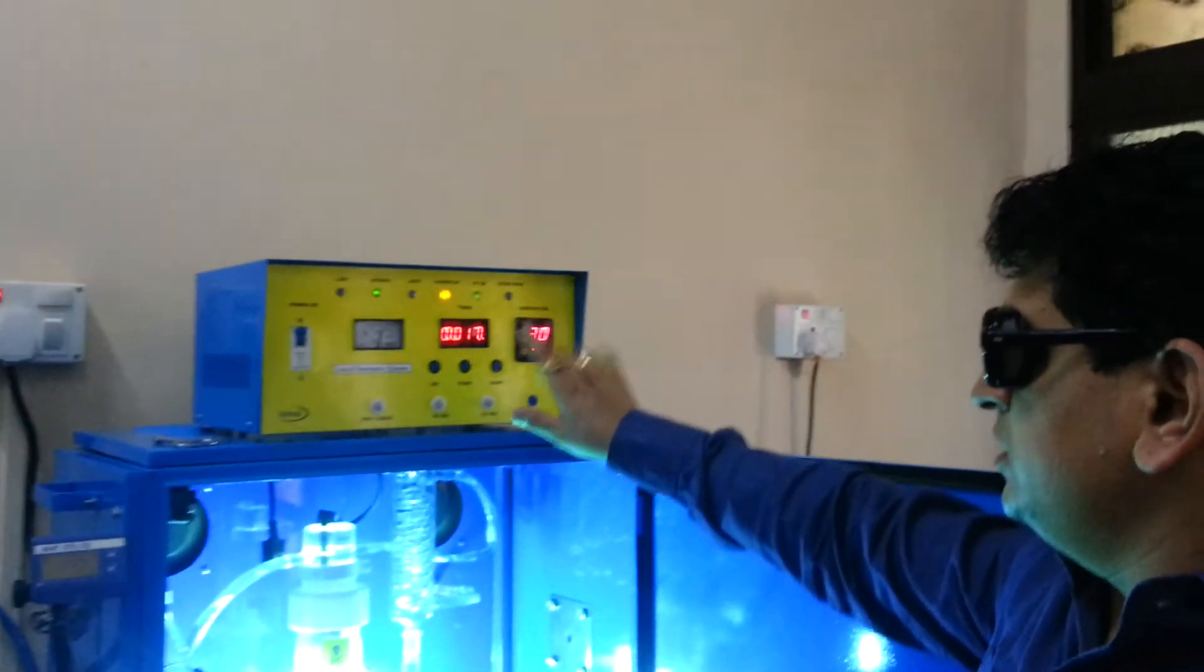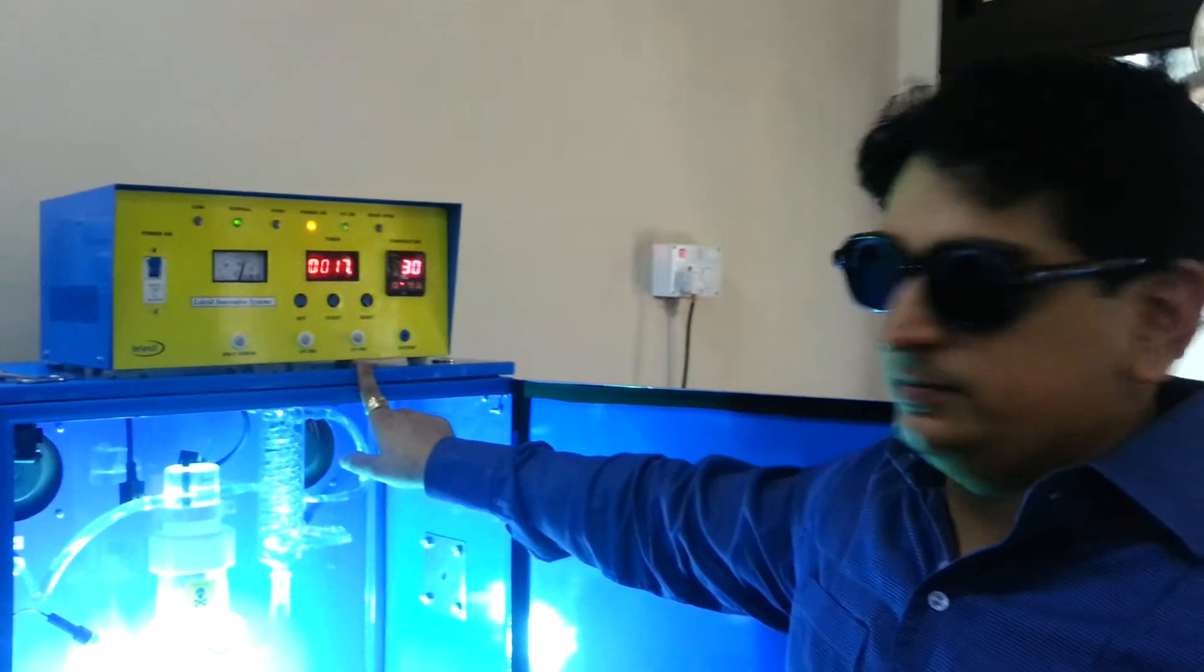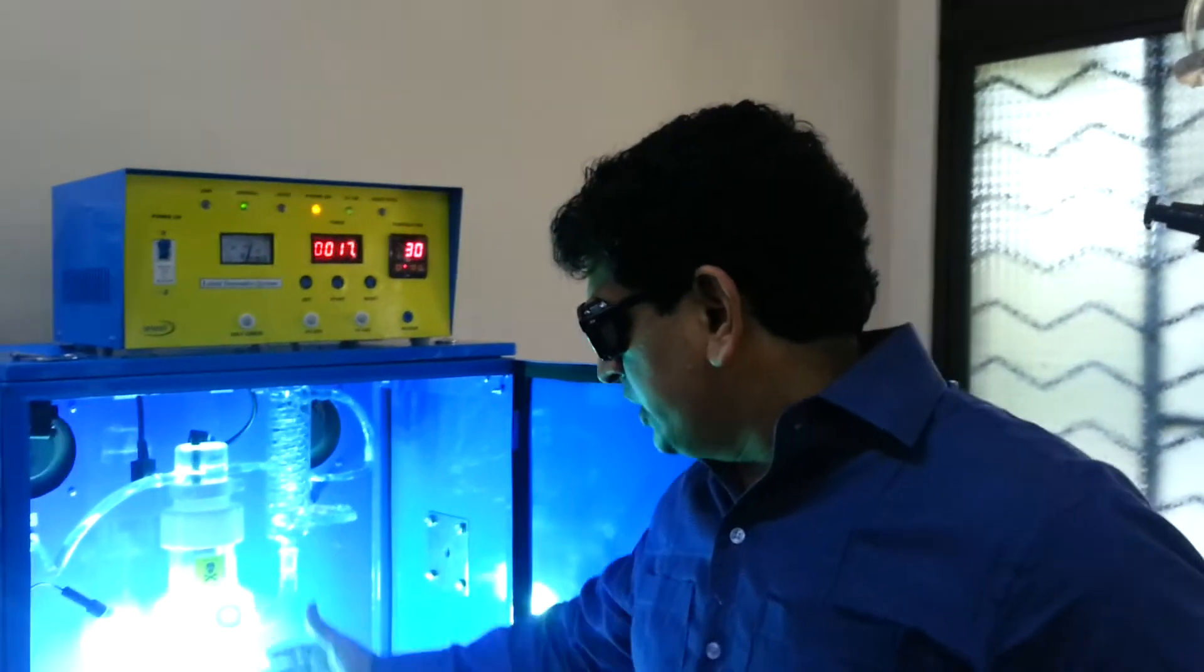This is a controller having dual option for 250 and 450 watt. Please have a look at this system.